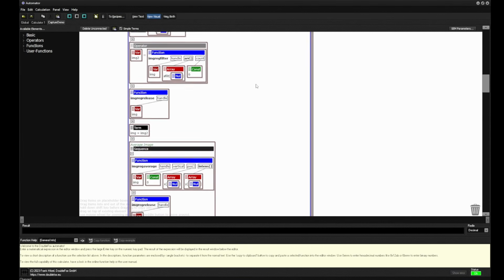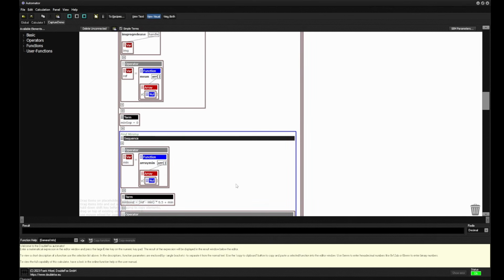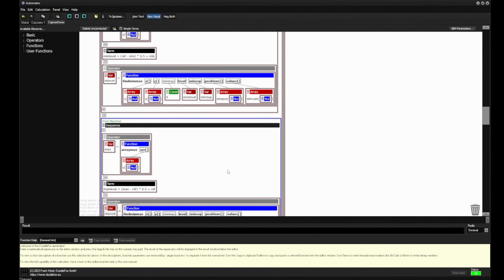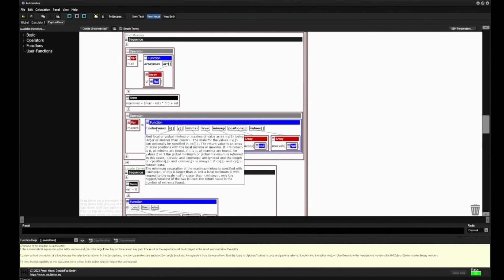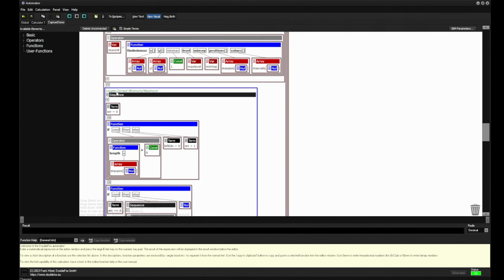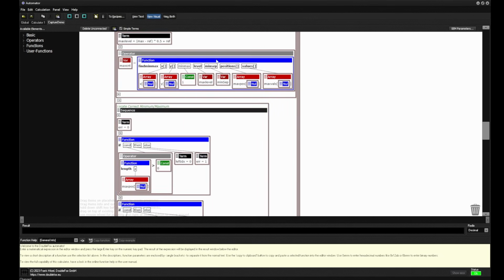Then we filter it a little bit, and then we average the image to the right, find the corresponding minima, find the maxima. This is used with the function find min max, which is built in. Then it takes the correct maximum and minimum.